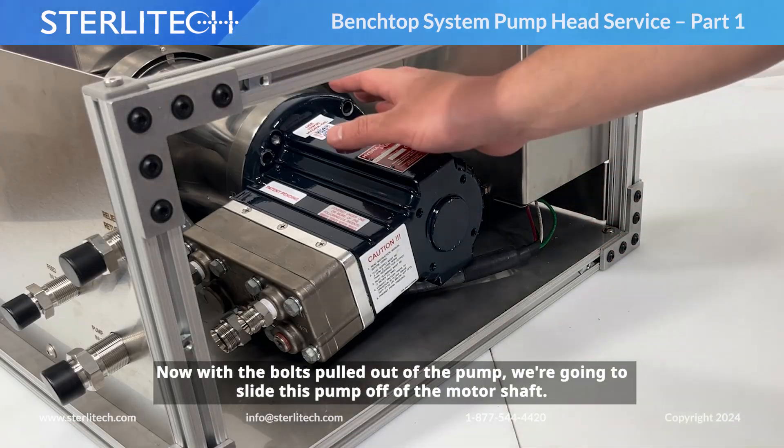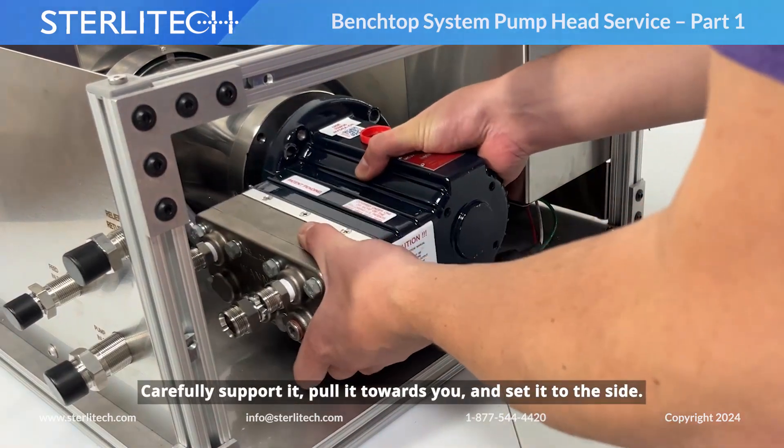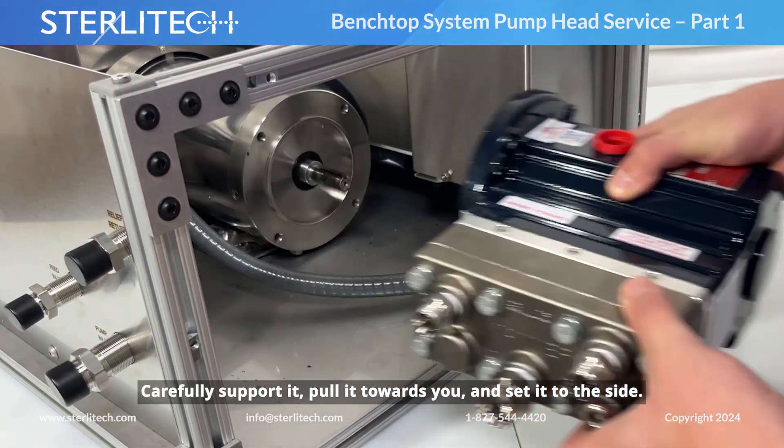Now with the bolts pulled out of our pump, we're going to slide this pump off of the motor shaft. Carefully support it, pull it towards you, and set it to the side.